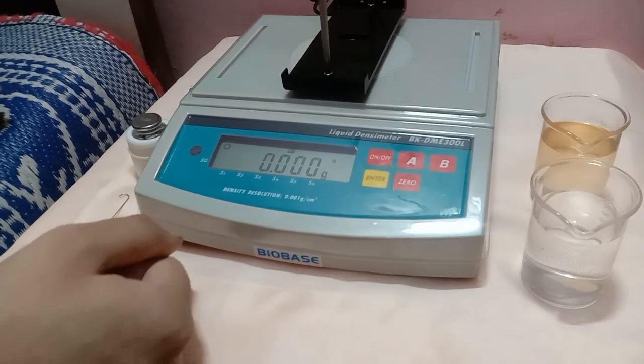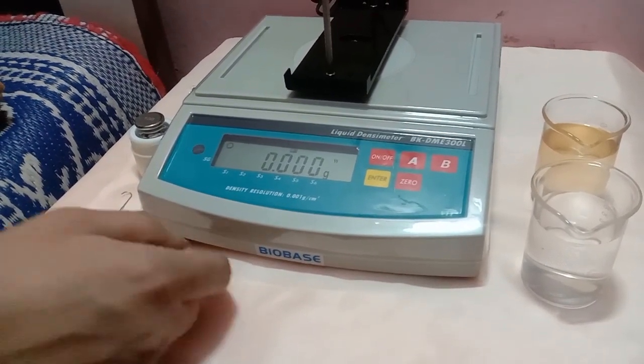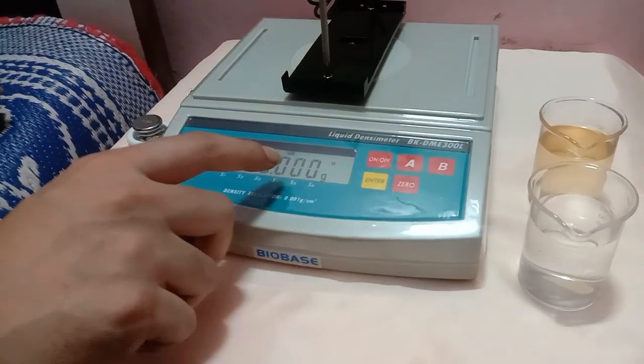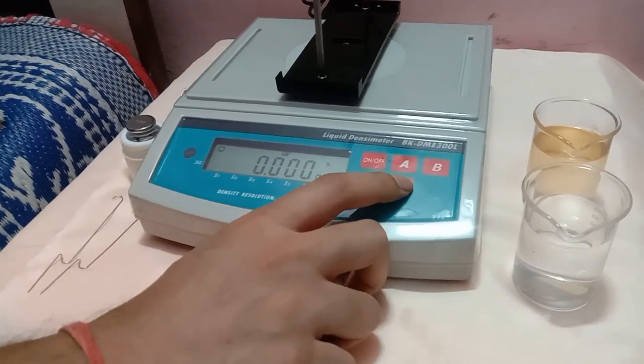The warm-up time normally is 2 minutes to 30 minutes. If the value is not displayed as 0.000, then reset the value by pressing the 0 button to 0.000.